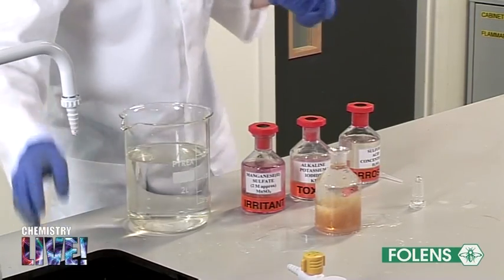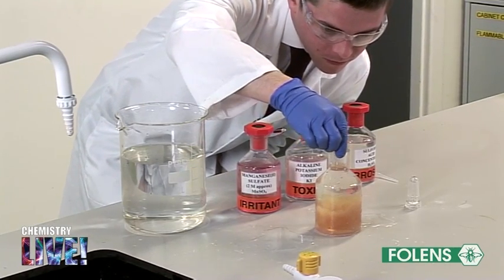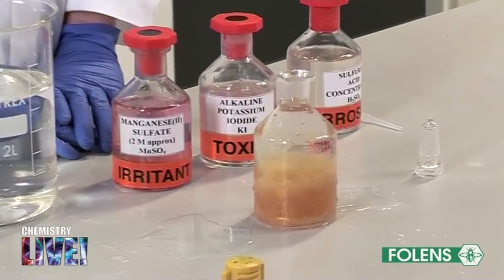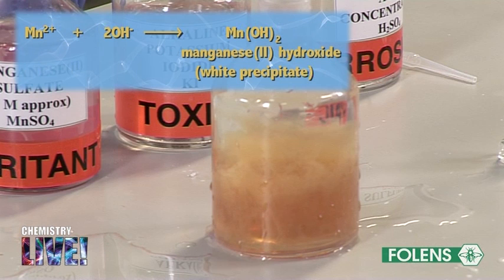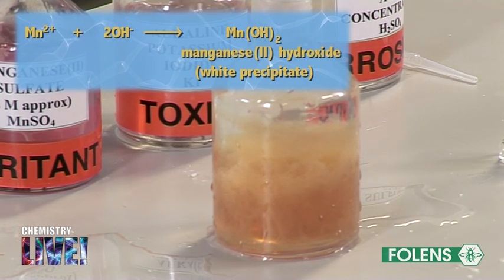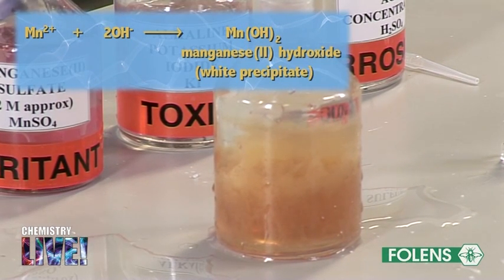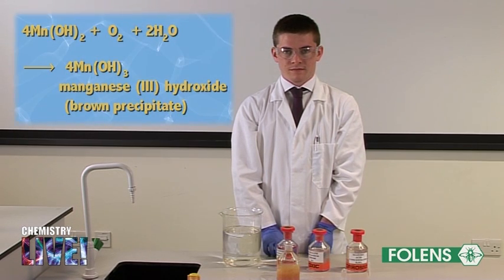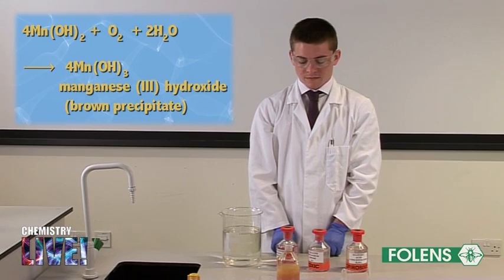When the manganese 2 sulfate solution (MnSO₄) and alkaline potassium iodide solution (a mixture of NaOH and KI) are added to the water, the Mn²⁺ ions and the OH⁻ ions from the alkali react together to form a white precipitate of manganese 2 hydroxide, as shown in the equation on screen. This white precipitate of manganese 2 hydroxide then reacts with the dissolved oxygen in the water to form a brown precipitate of manganese 3 hydroxide. The equation for this reaction is shown on the screen.